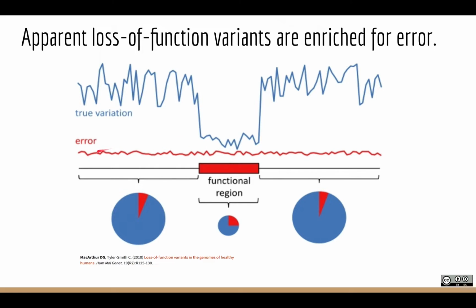And there's some level of error in our sequencing experiment. Some of it comes from base calling errors made by the sequencer, and some of these errors come from, say, just problems properly aligning the sequences to every position in the genome. So there's this low-level error rate that's fairly uniform across the genome.